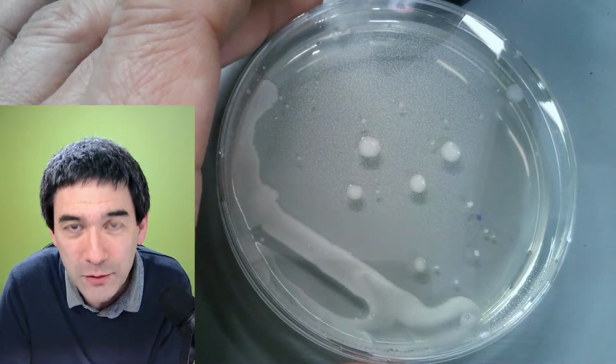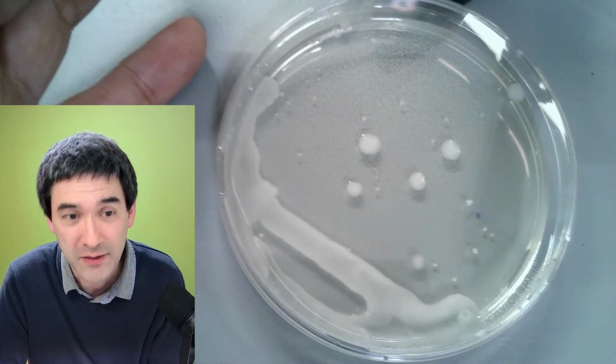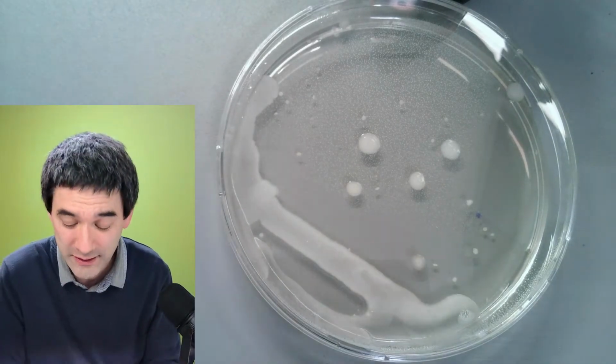Why should they not be there? Because these are contaminants that fell in from the air, right? So I was not working sterile. Right? That's why I'm saying it's an embarrassment. This is a disaster, okay? This is a no-go, right?